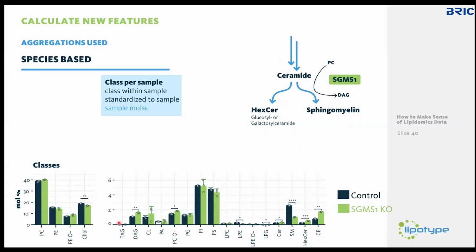So this makes quite some sense. And all the other changes you might have might be actually ripple effects. So if you mess with sphingomyelin, you actually probably get something in the ether lipids. But yeah, these are often things that are more complicated and more sophisticated because the whole lipidome has to react.